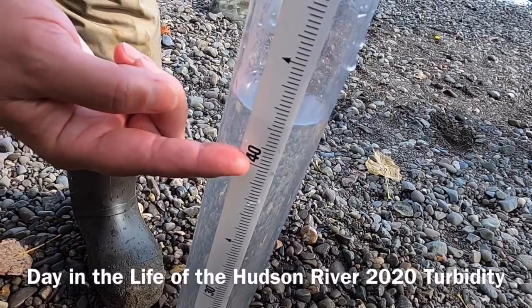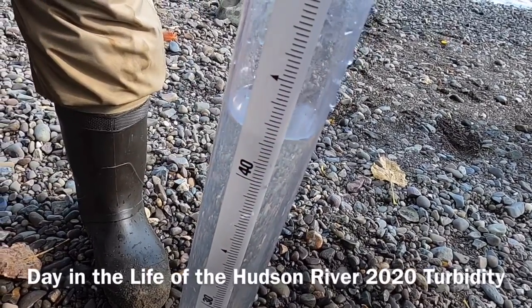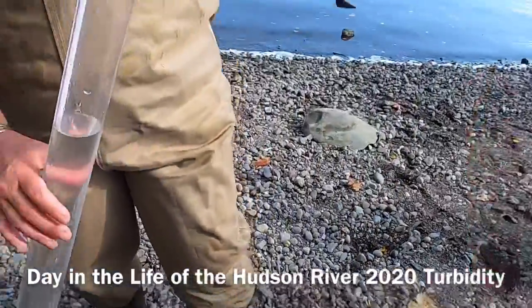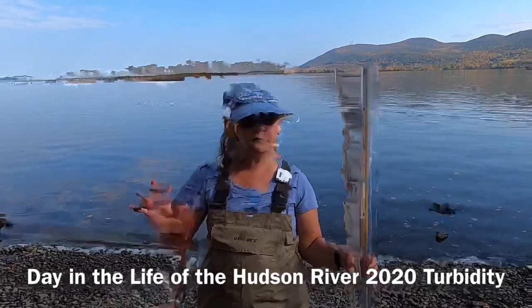Okay, so this is 40, 41, 42. Okay, so that's 42 centimeters on our turbidity tube, and that's given us an idea of what's all floating in there, right? A good amount of it is going to be organic pieces of plant material, but then some of it is going to be sediment that's been kicked up with, like I said, that precipitation and the tides.